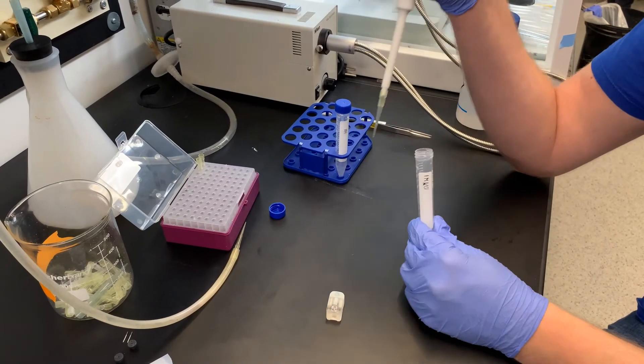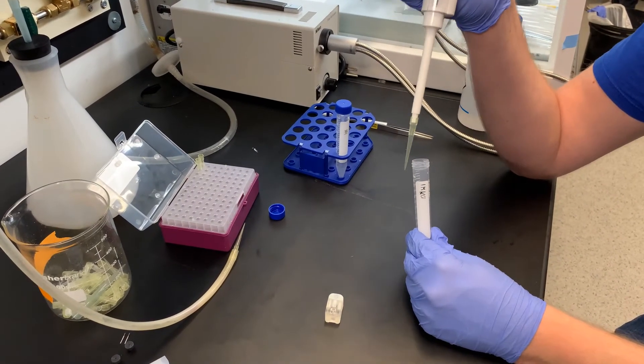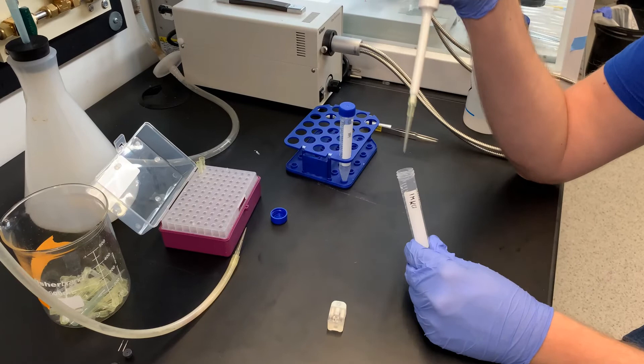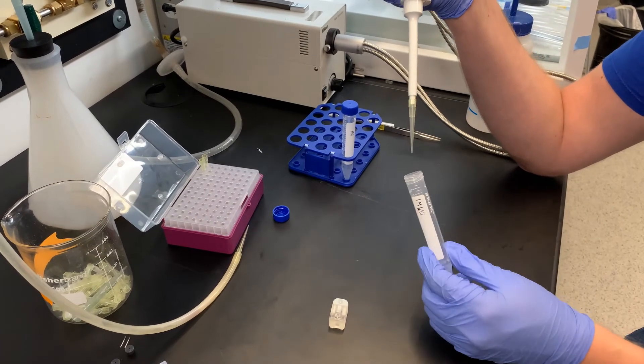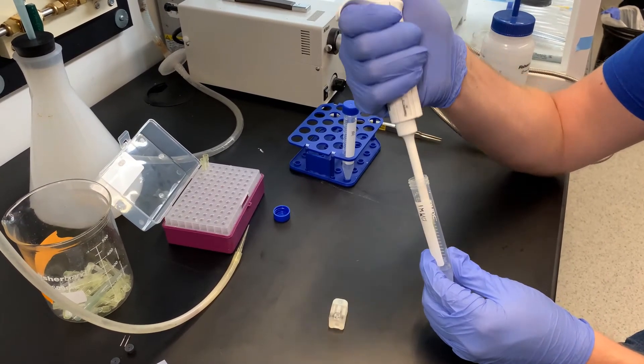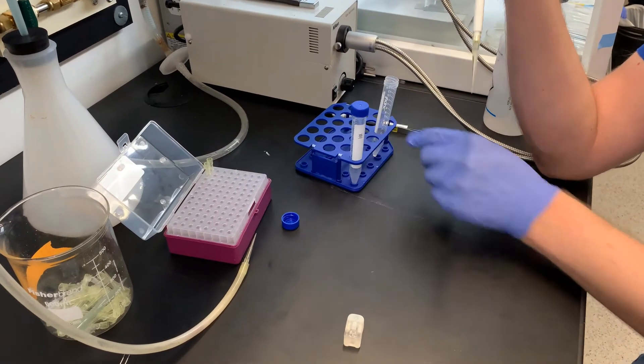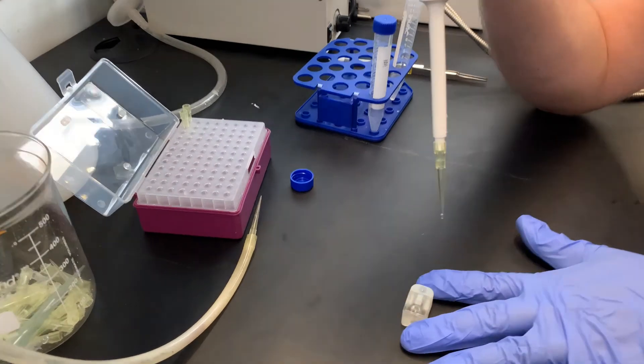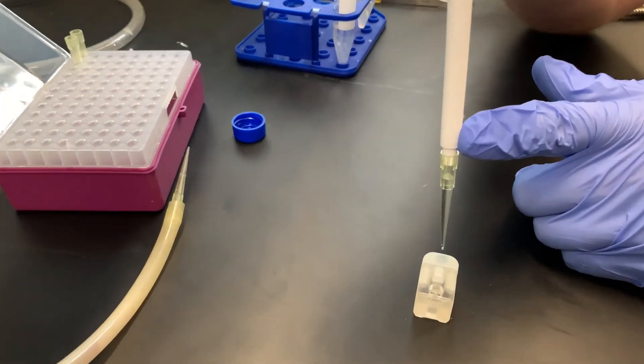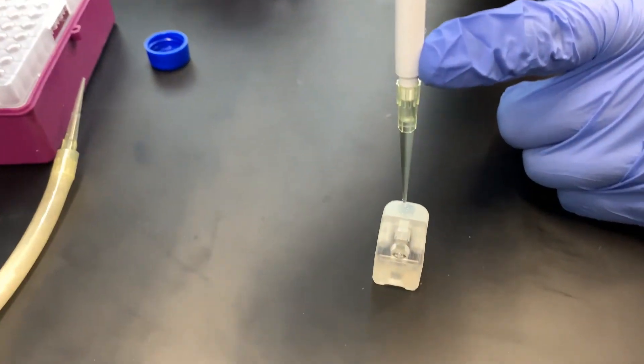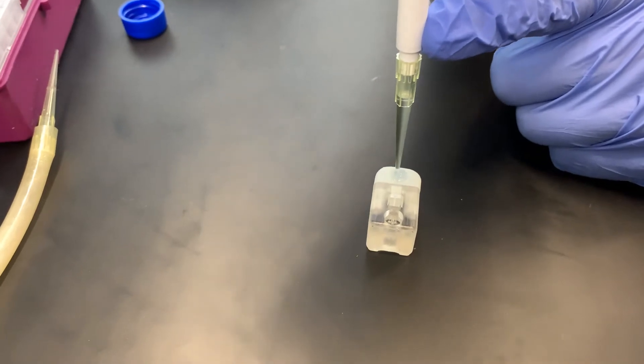Because there's fluid already in my cell, I want to make sure that I don't inject any new bubbles. I'm going to do this by first taking 200 microliters of KCL and I'll eject some of the solution even before reaching the fluid to make sure that I don't inject any bubbles.